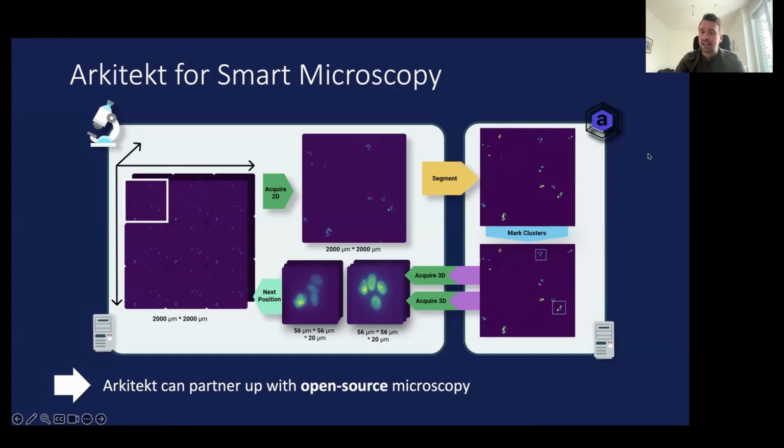So Arkitekt is taking care of the orchestration, and we use Micromanager actually for this, because it was just easier to program. It does sort of the tasks. So you set up the whole acquisition in Micromanager, interactively, how you used to, and then you just start running this script. And Arkitekt uses the information that it has in the metadata, which is important because we need to know which objective we use to do this translation back from image space to microscope space.